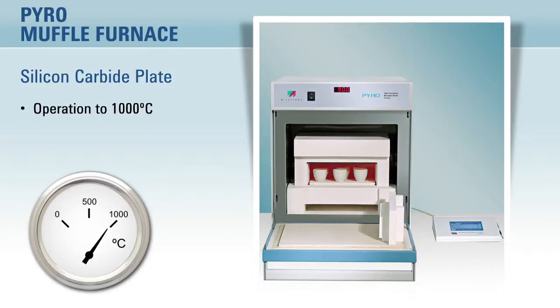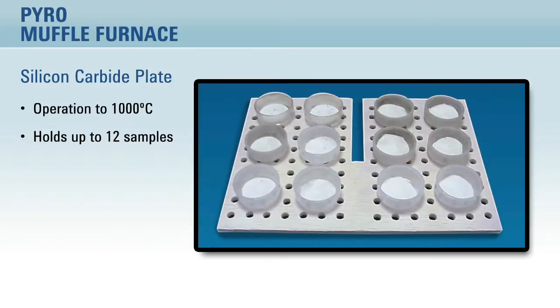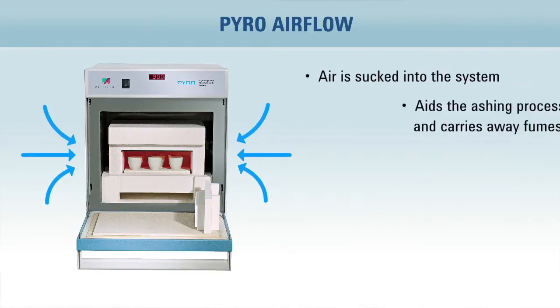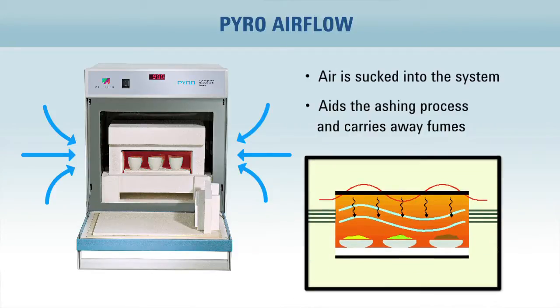The Pyro can operate up to 1000 degrees Celsius and can process 12 samples at a time in various types of crucibles like quartz, ceramic and glass. During the ashing process, air is sucked into the system that not only helps with the ashing process but also draws away the fumes and vapors.